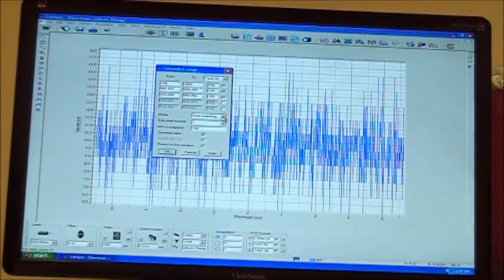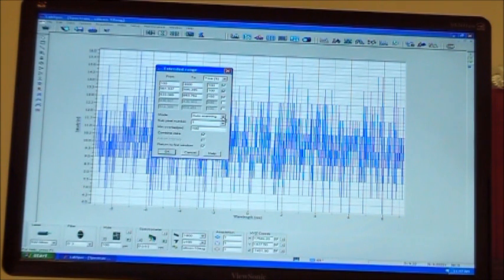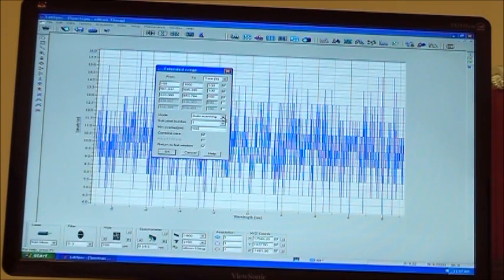Now granted, if you use the multi-window mode though, the multi-window mode does not work well when you have something that fluoresces. Especially something that has a fluorescence that changes over time as you're going through a type of fluorescence absorption or something like that. Because every second that your sample's in the laser power, the fluorescence level will change some. Right. So when it goes to the next window, the intensity of your background has already went up or down by a couple hundred counts.